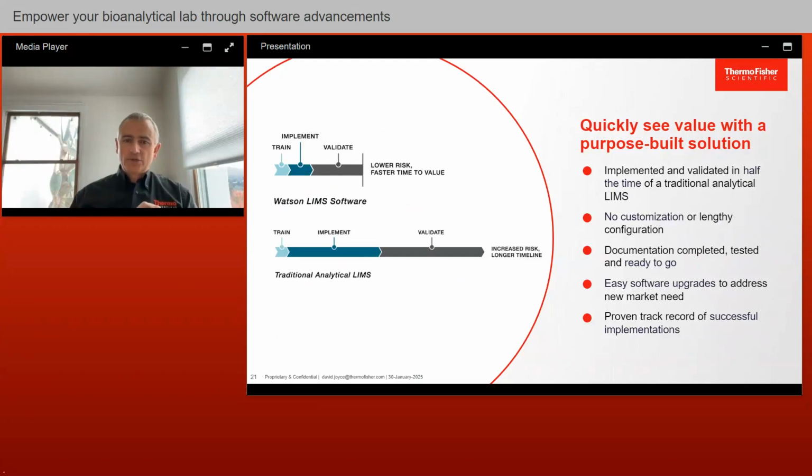And some of the issues that you see, I mean, when you do start to use any type of computer system within this environment, it needs to be validated. The process is somewhat onerous. Things have changed probably in the last 20 years, whereby a little bit more of a risk-based approach to validation is being carried out, whereby you emphasize the testing of the parts of the system that will have potential influence on the data quality. You emphasize that more than, say, the printer drivers or some of the user experience type of things.